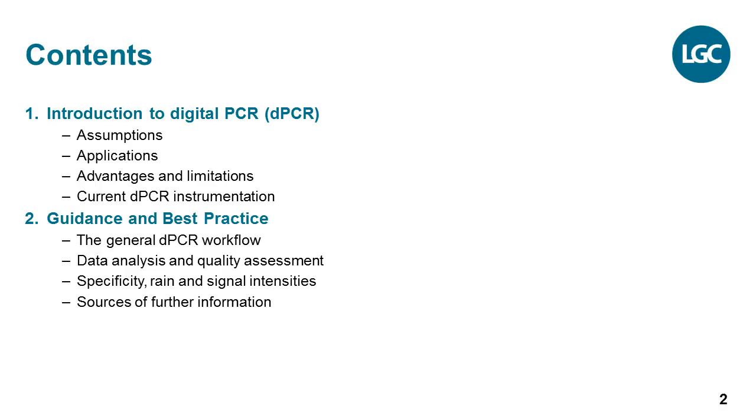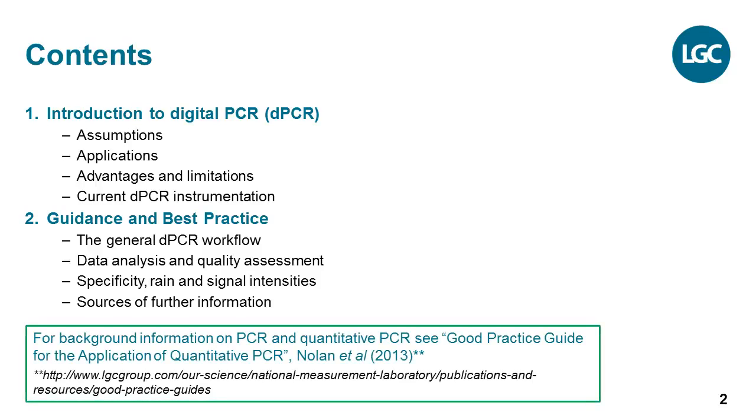It is assumed that you have a working knowledge of both PCR and quantitative PCR. However, if you require further information, please refer to the 2013 publication Good Practice Guide for the Application of Quantitative PCR by Nolan, Huggett and Sanchez, which is free to download at the URL displayed at the bottom of the slide.